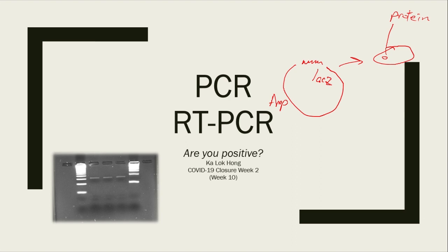But the real screening people need to do for good verification is actually to do a PCR, or polymerase chain reaction. And we're going to talk briefly about some of the concepts behind it. We're not going to focus on the technical details of how to do one of those things. It's never going to be technical. It's more of an informational background.